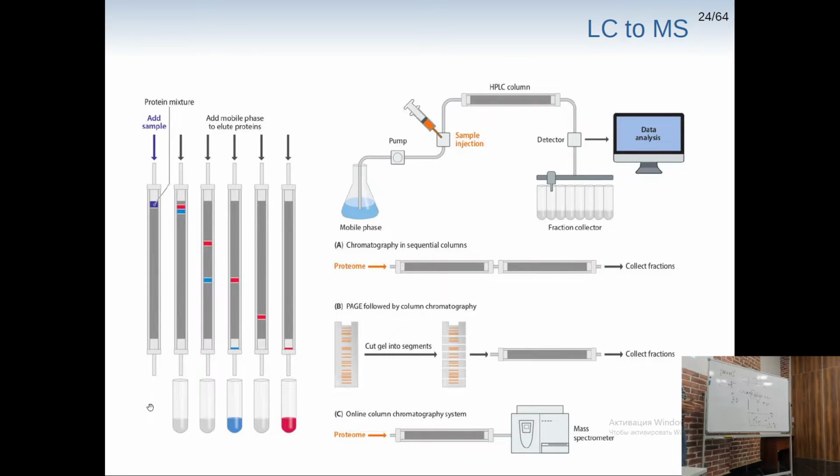Solubility, right, we can use it, but it's not quite easy. But charge, we can use it for cation or anion exchange chromatography. You were right here. Also, hydrophobicity, right? We can use it as well. These are the main three different ways, and also we can play around with different interactions between proteins: protein and antibody, protein and other protein, and so on. And also we have affinity-based chromatography, so-called.